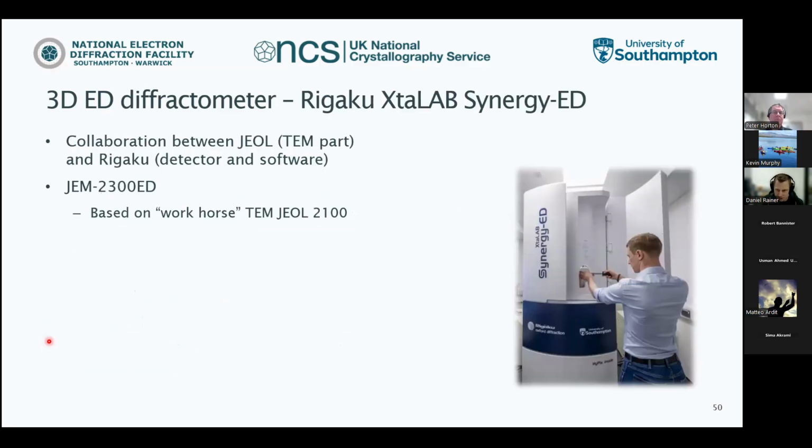Now, this is then what the instrument actually looks like. I could just unblur and we would see it here, but this is possibly for now a bit nicer. So this instrument that we have is the Rigaku Synergy-ED, and this has been designed and is produced as a collaboration between JEOL, who's a very well-known electron microscope manufacturer, and they contributed with their knowledge and the design of the EM part of it.